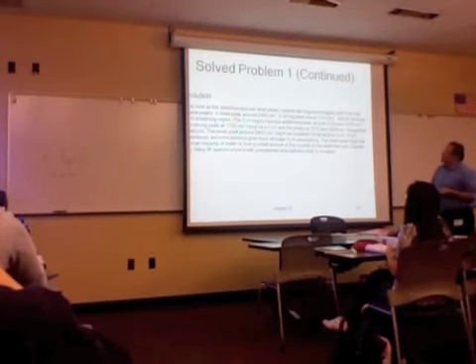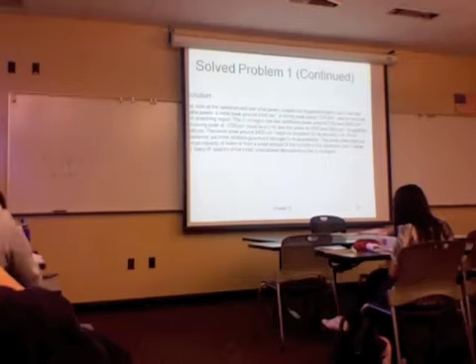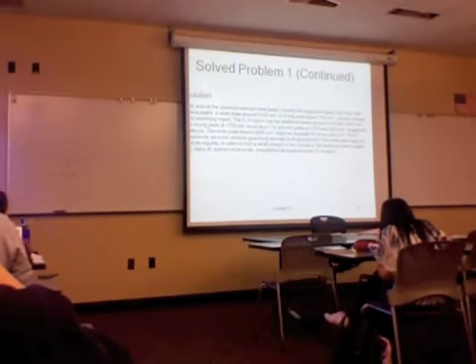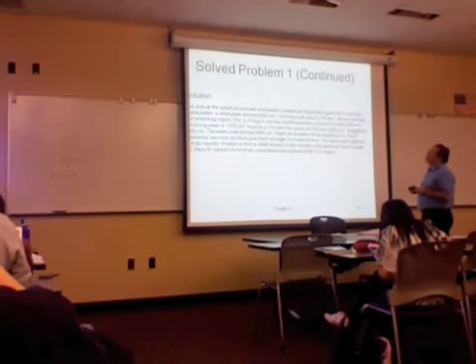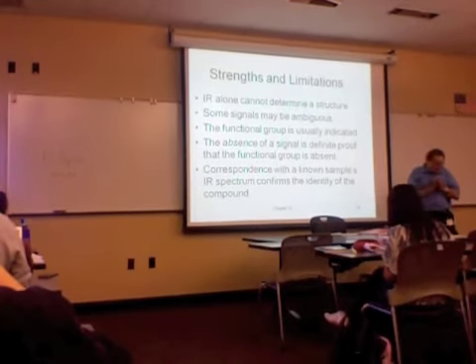And here's what we just went through, and ultimately we come to the conclusion, because of these 2 peaks here, that we've got an aldehyde. Strengths and limitations.